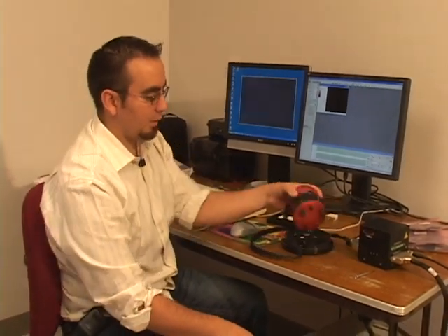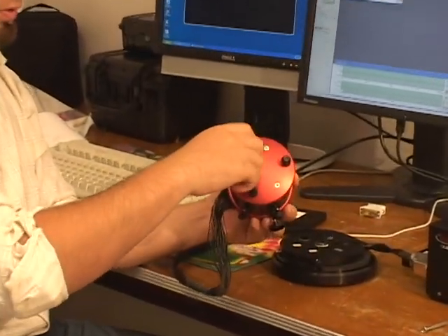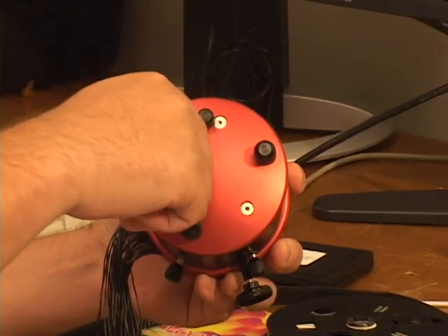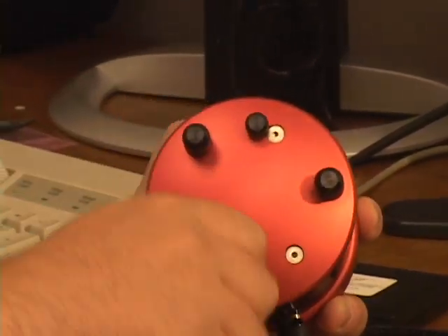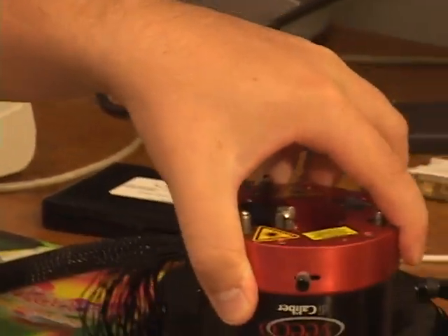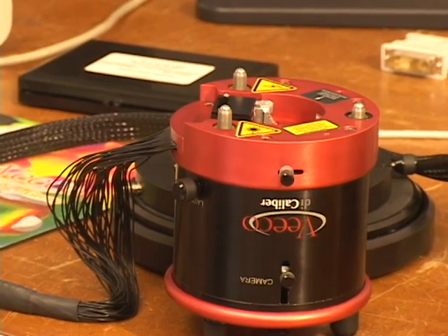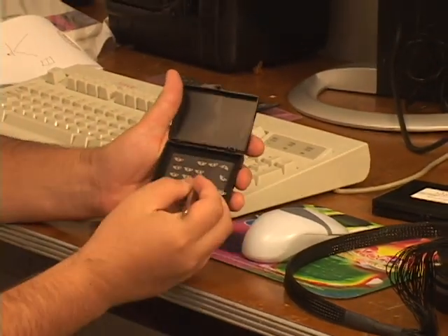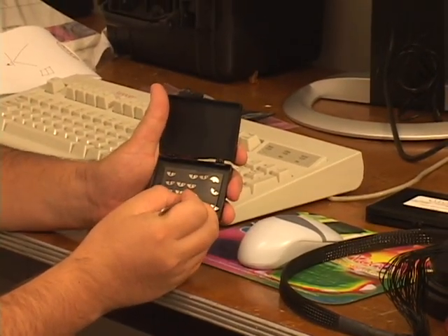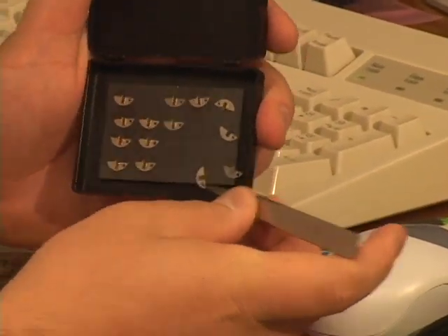So the first thing you want to do, if you have the head, is screw in the 2 manual translation screws all the way in, so screw them in clockwise. And then flip the head over. Now, grab a probe, and you could slide them out using the hole on the half moon pucks to the edge, and then grab it from the edge.